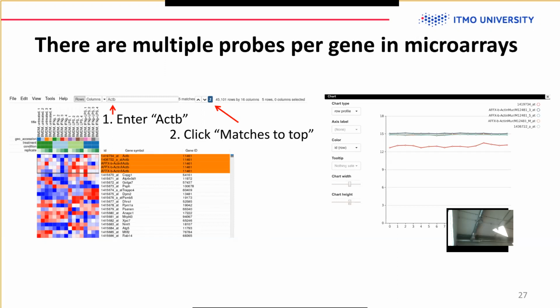Let's just average all the values in the samples. So we have 5 measurements in one sample, 5 in another, and so on. Just average them, and this could work fine in theory, but in practice, what we can find here is that not all of these probes are equal in their quality.